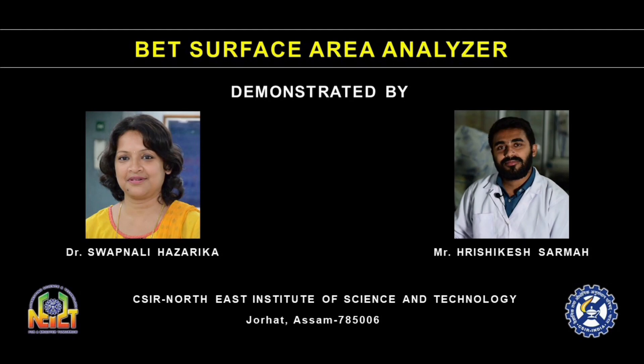Hello everyone, I am Hrishikesh Sarma and I am going to give a brief demonstration on BET surface area analyzer.